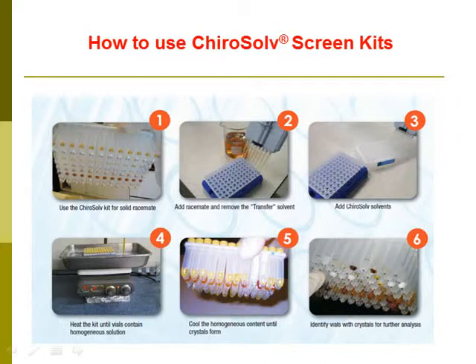Heat the 4 kits with mixture until the vials have homogeneous solution, up to 80 degrees for up to 5 minutes. Cool the kits at room temperature. If needed, freeze them to get the maximum crystals. Pipette out the filtrate and analyze the crystals. Choose the conditions that offer highest quantity of crystals and highest purity.